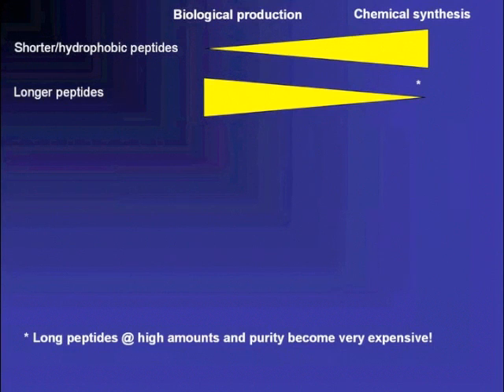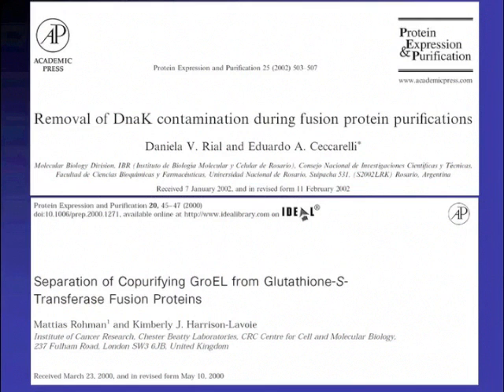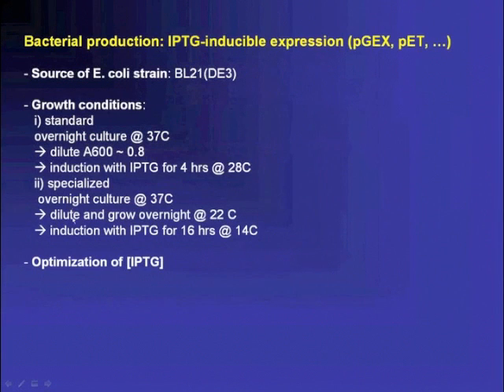Actually, that links nicely to the next question. You've mentioned that this is good for producing peptides. Do you have any feel for the maximum peptide length you could make? Actually, I would say that you could go up to 100 amino acids and even longer. Of course, then it becomes a fusion protein and not really a peptide anymore. Using this method I think you have no restrictions. If you use the specialized expression protocol, I think there are no limitations. We go up to 300 amino acids, even 600 amino acids, but of course then it's not a peptide anymore, but it's your freedom. Yeah, I suppose then you're looking at a protein.